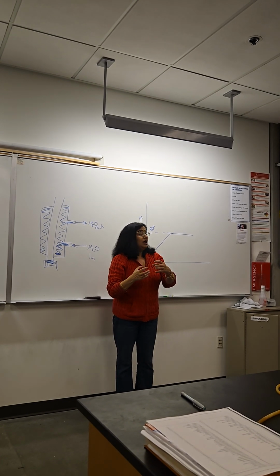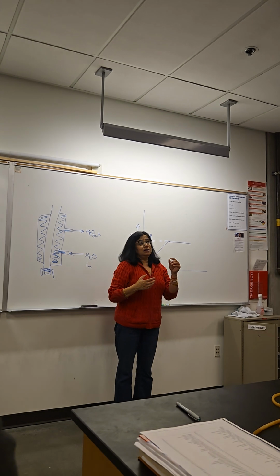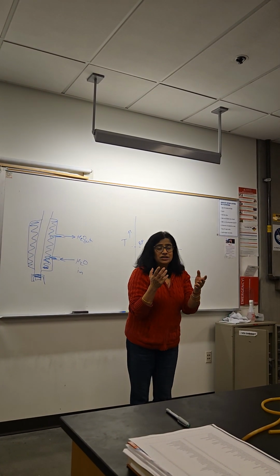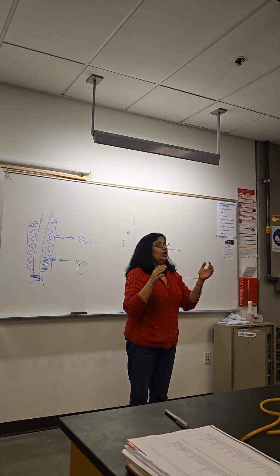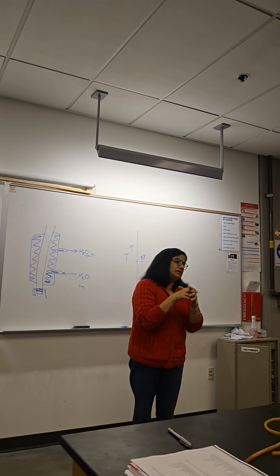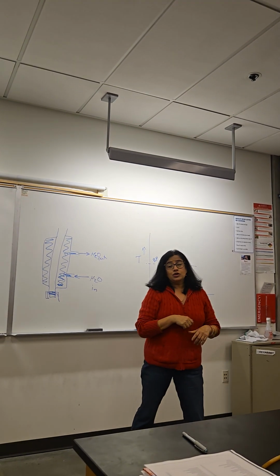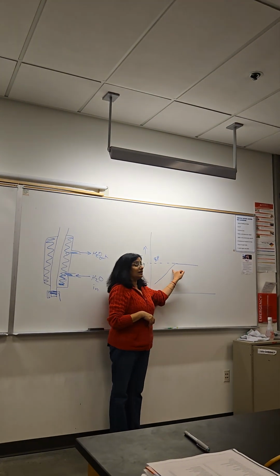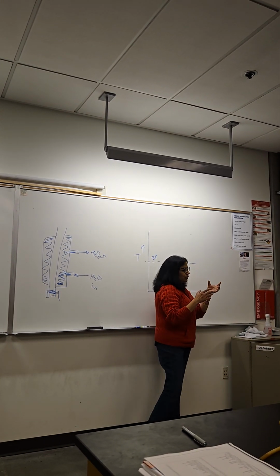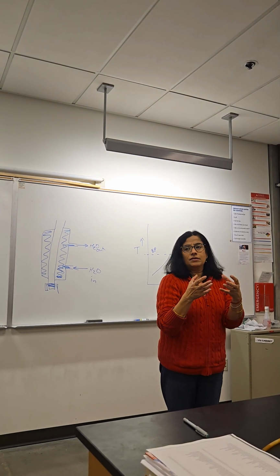We good? If that doesn't happen, then most of the time it is the temperature, it could be a 1 to 2 degree range also, when most of your distillate was collected. So you've got to keep an eye on that. Does that make sense? So it is not the temperature when the distillate started, or when the distillation finished, it's the temperature when most of your distillation happened.